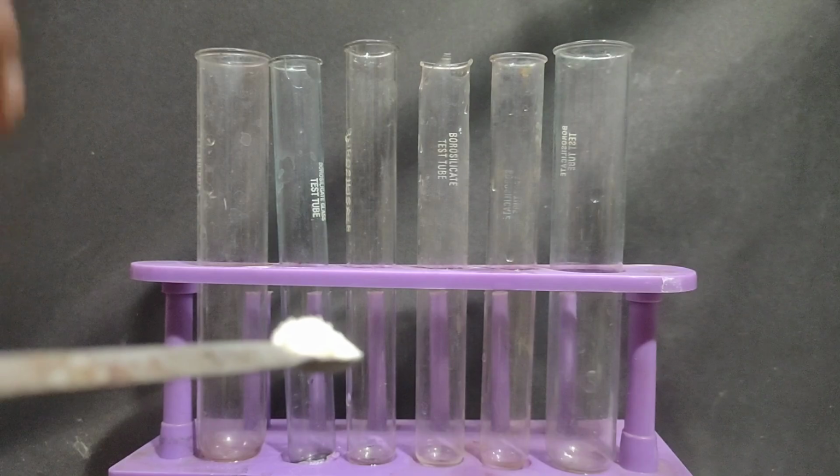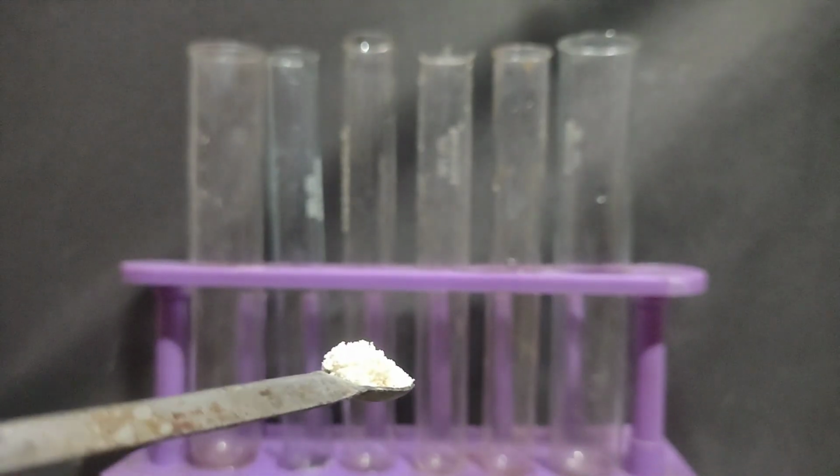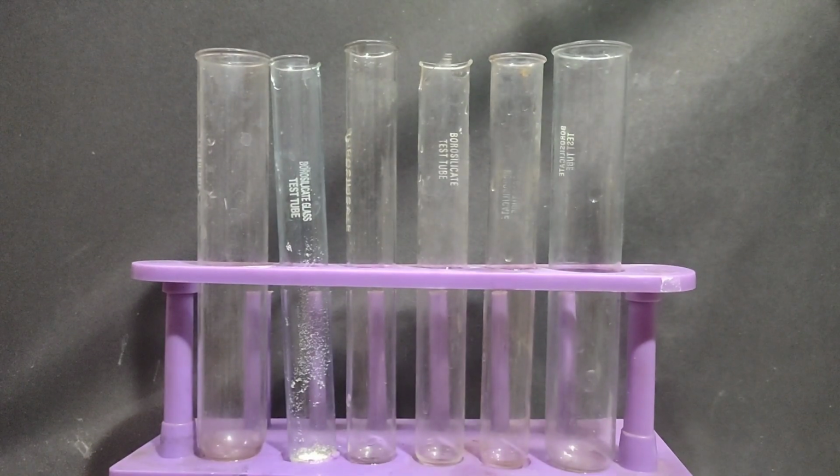Okay, you can observe that the salt is colorless and crystalline in nature. So I will take some of this salt in a test tube. As you know, first we check for group 0. Only if group 0, which is ammonium ion, is absent, then only we will perform the test for group 1. Since I know that lead is present, I am not wasting time in showing you the negative test for group 0, because I have already made the video on test for ammonium ions.